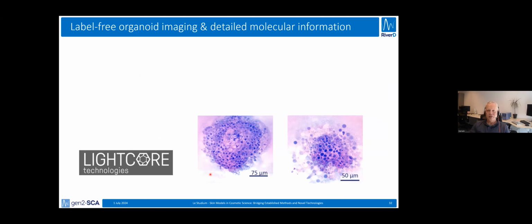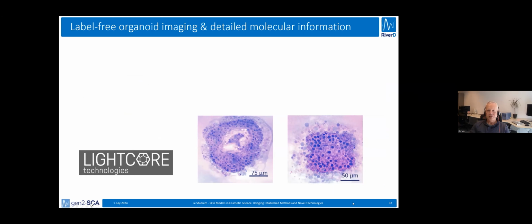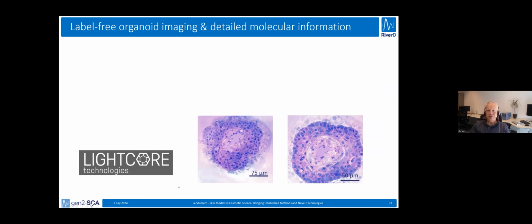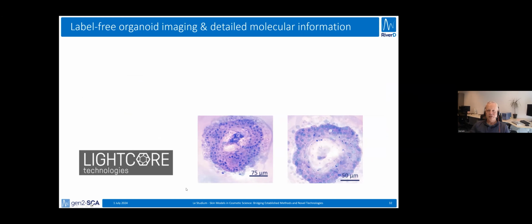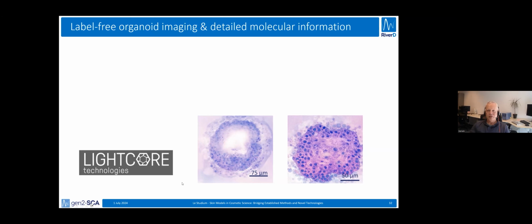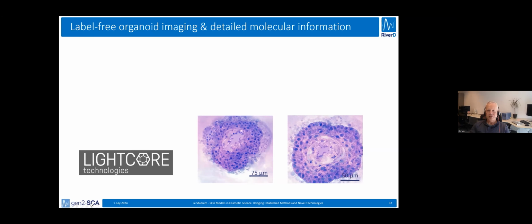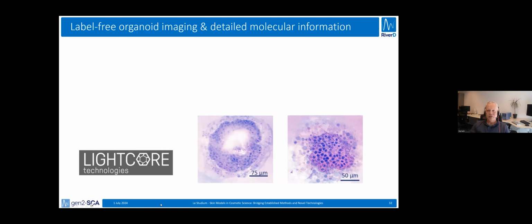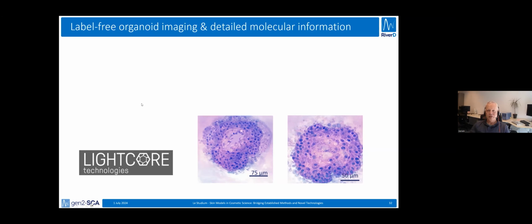And these imaging techniques can also be used almost at video rate. So you see here some scans through an organoid, not a skin organoid in this case. But you see almost like an H&E like slides, but this is fresh tissue, virtual staining. So without using any labeling or stains.